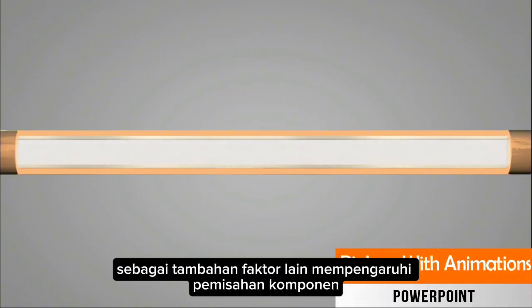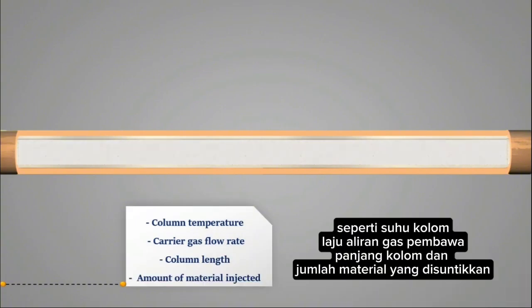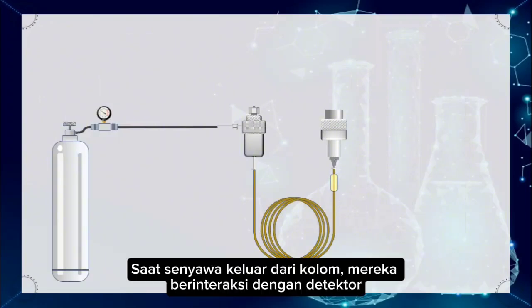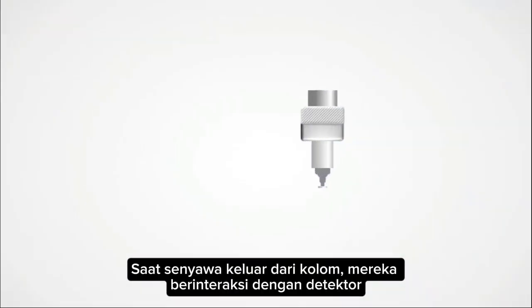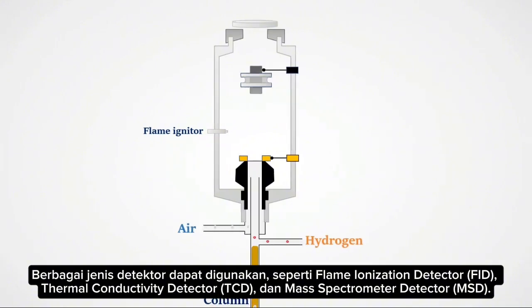In addition, other factors influence the separation of the components, such as column temperature, carrier gas flow rate, column length, and amount of material injected. As compounds elute from the column, they interact with the detector. Different types of detectors can be used, such as the flame ionization detector, thermal conductivity detector, and mass spectrometer detector.